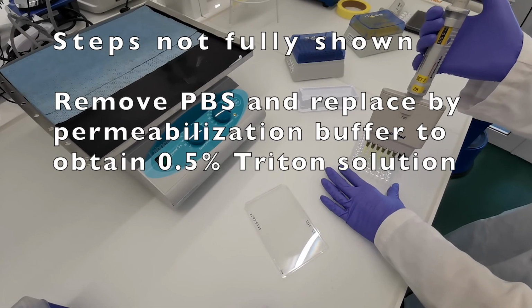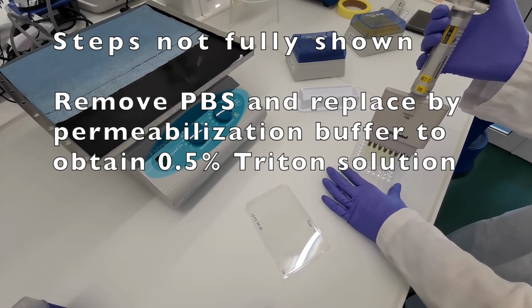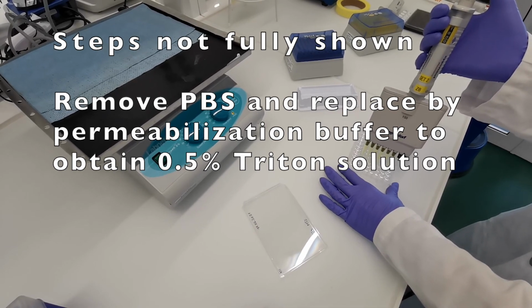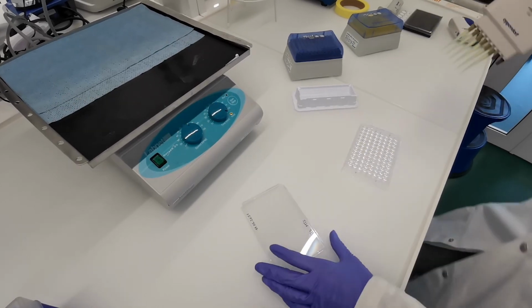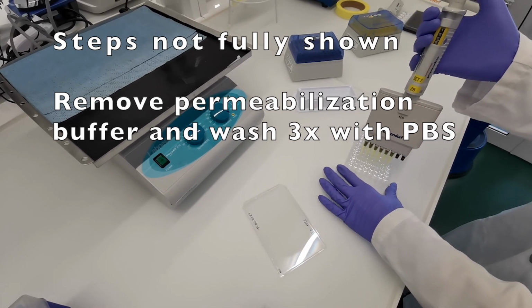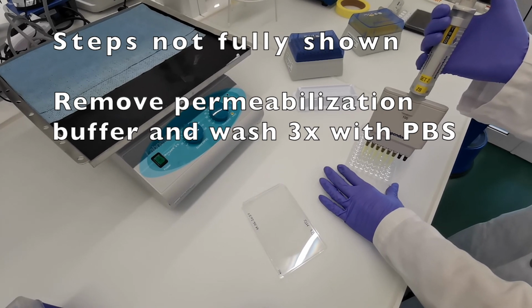50 microliters of the PBS is removed and replaced by 50 microliters of permeabilization buffer. This will obtain a final 0.5% Triton solution, which is sufficient for permeabilization. Following the permeabilization, remove as much permeabilization buffer as possible and proceed to wash with PBS 3 times.